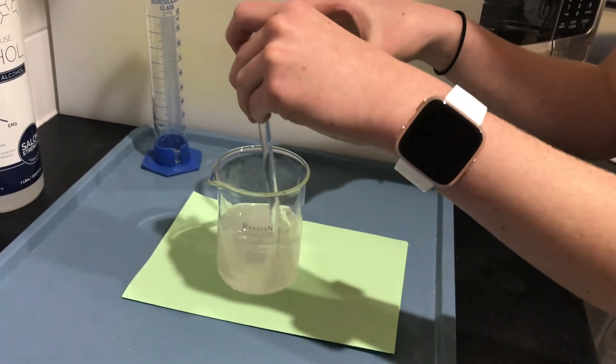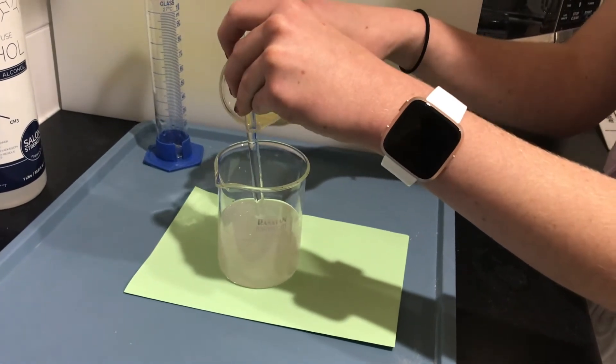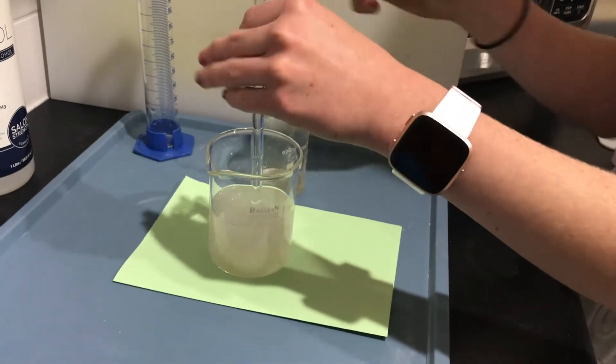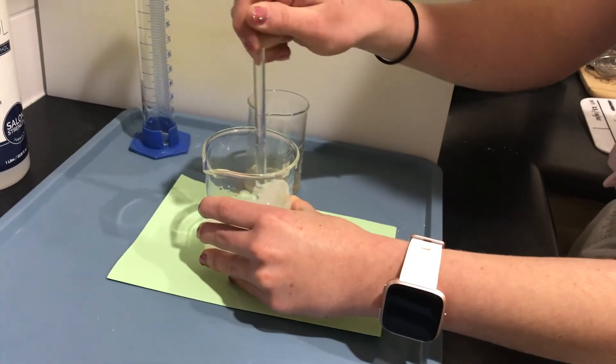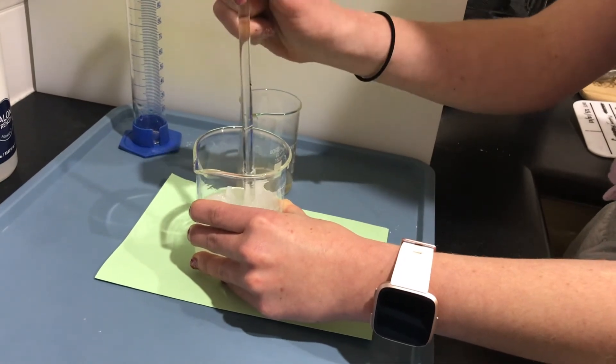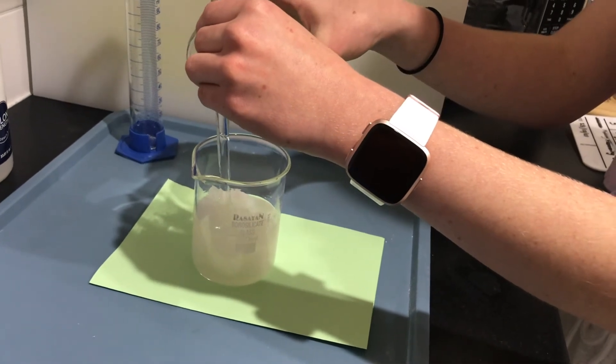What is happening here is the gel forms due to the reduction of solubility of the calcium acetate once the isopropanol alcohol is added. The calcium acetate precipitates rapidly, which forms a network of microscopically dispersed insoluble particles found throughout the liquid, which then attracts the liquid within it, forming a gel. This is called a colloid.